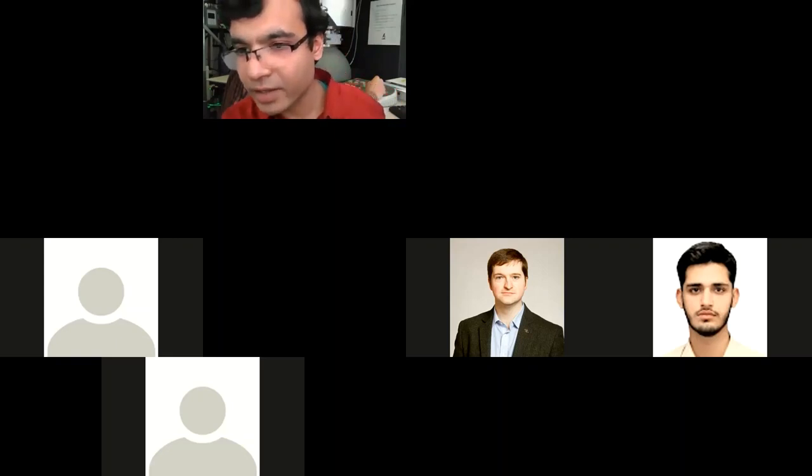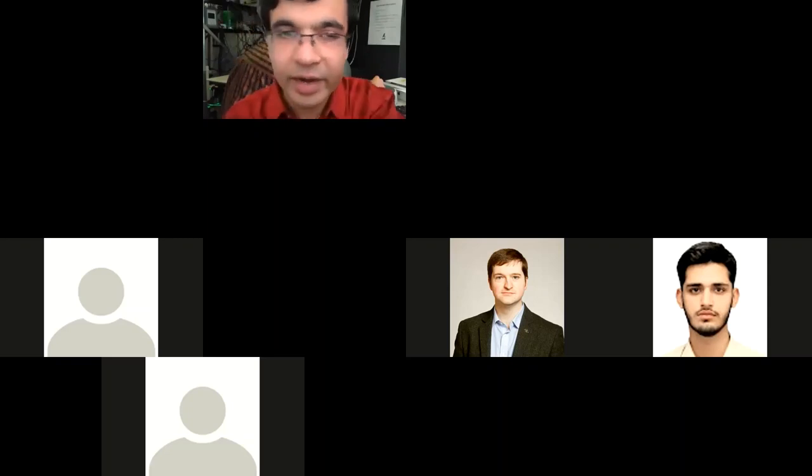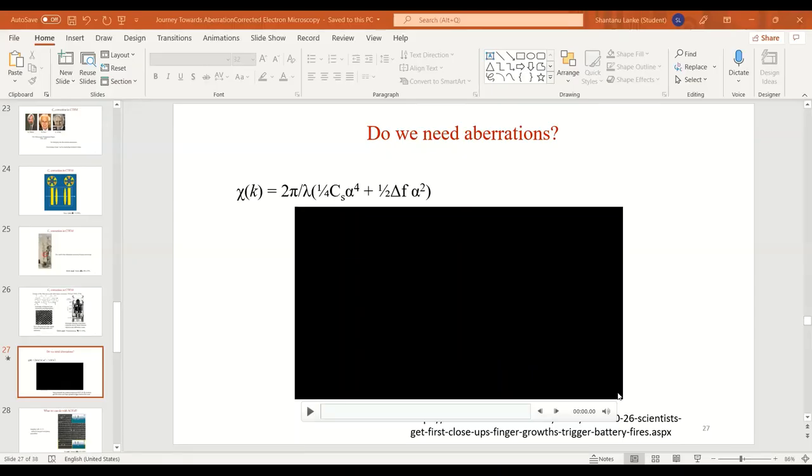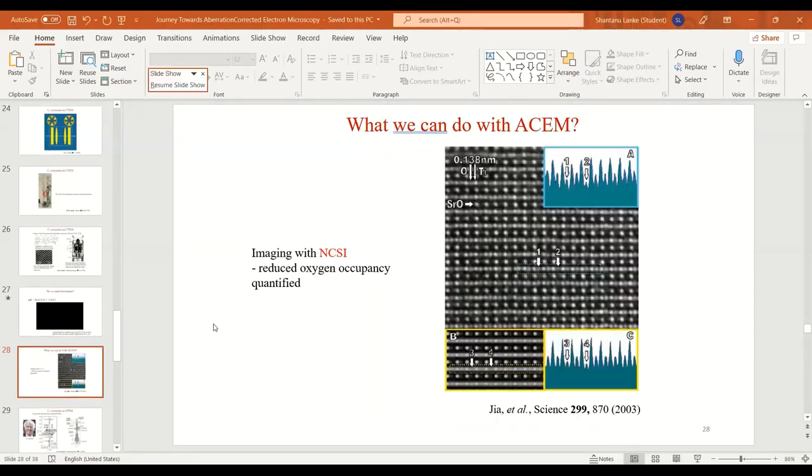So I can see here one question: what is the difference between image corrector and probe corrector? Okay, so in the image corrector, let me go back to the slides.